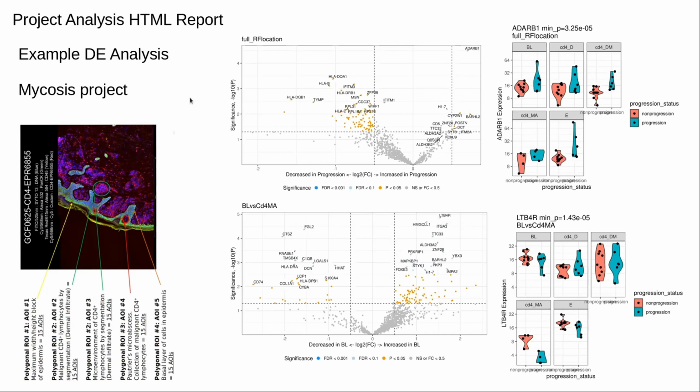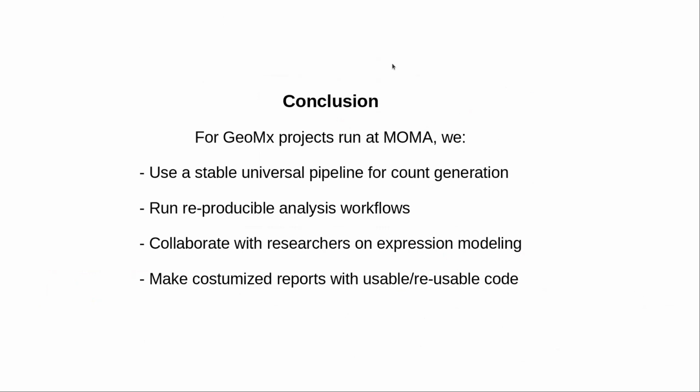And in conclusion, for the GeoMx projects that we run at MoMA, we use a stable universal pipeline for generating our counts.